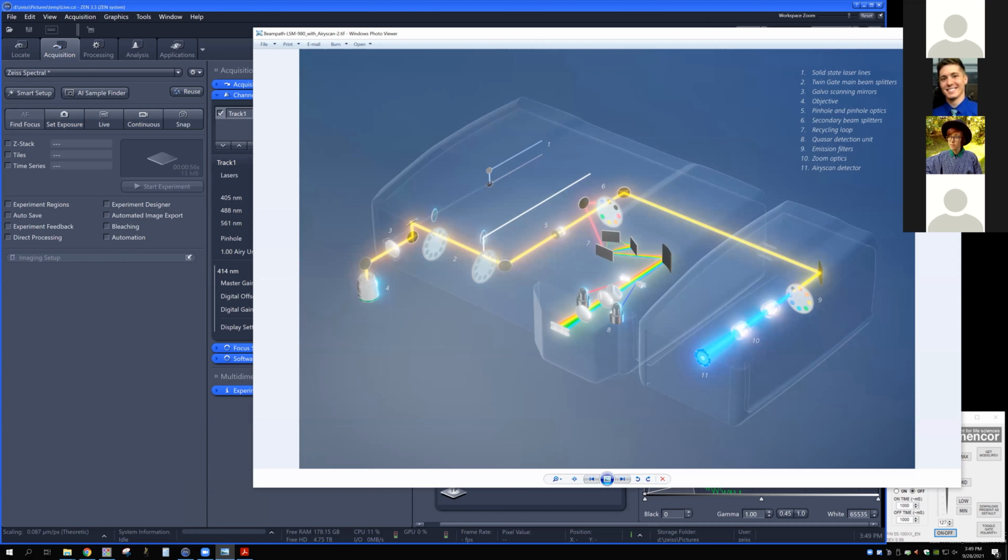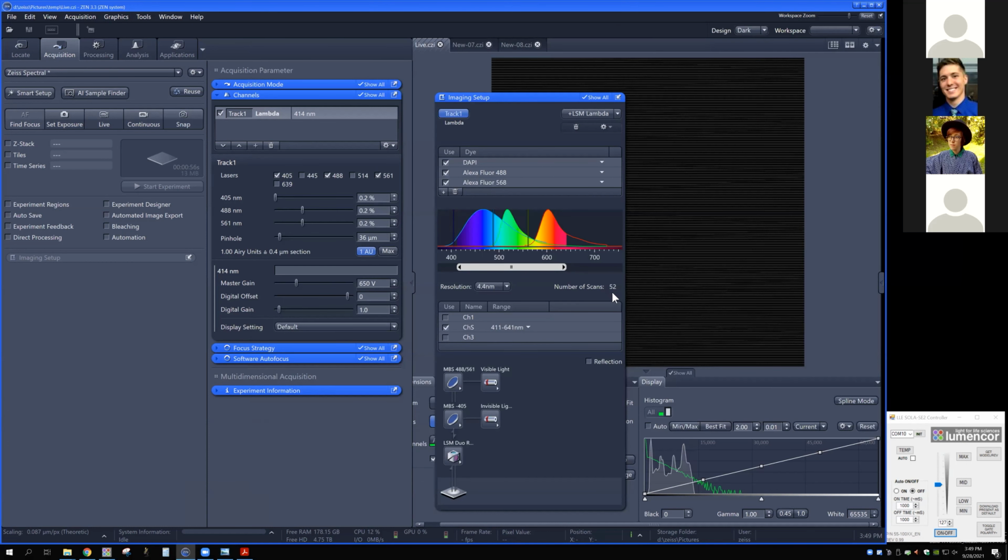So we now have to move something again, and it takes a little longer, and it means we have to do this sequentially. We have to move those between every single scan to collect the entire image. So the point is, I highly recommend not going lower than 8.8 nanometers. You really don't need to anyway.